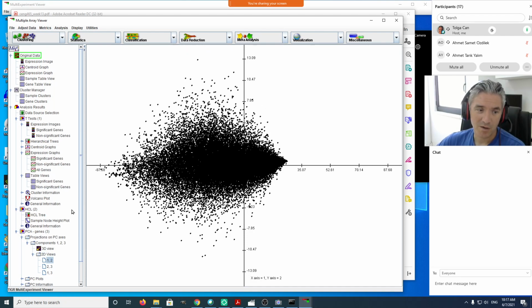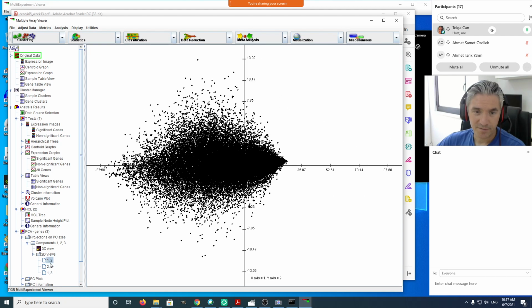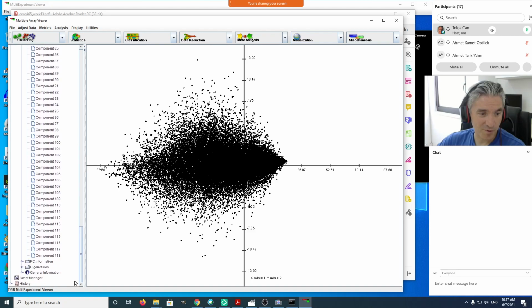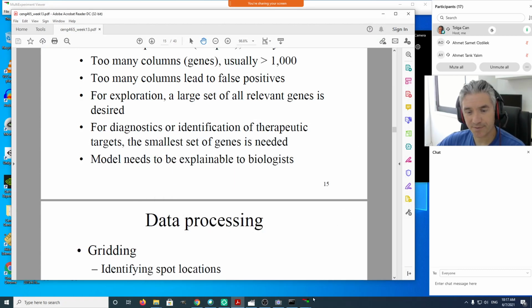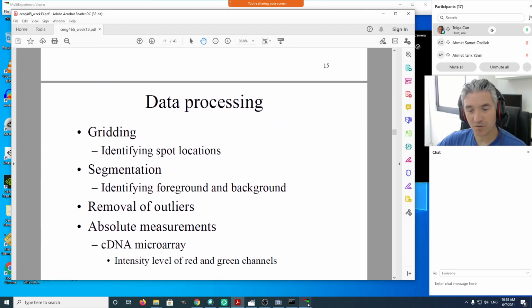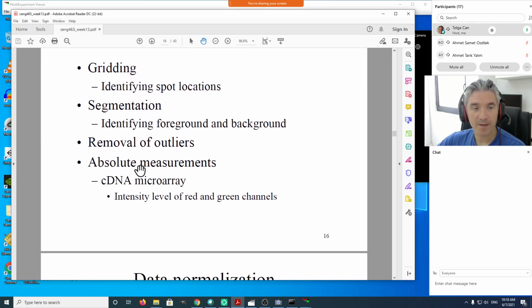So these are all over the place in those two samples, as you can see. You can look at the principal components, the PC plots. There are lots of components. I think these are the genes, that's why we have them. We need to do it on the samples as our clusters. Anyway, principal component analysis is also one of the tools implemented in this, so you can play with it and do it in the correct way to reduce your data to a lower number of dimensions.